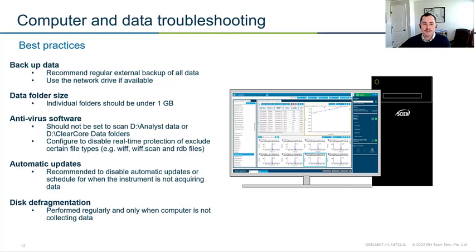The next thing you can do in terms of preventative maintenance is keep those file sizes down. Speaking from a SCIEX perspective, when we save data, we save them in a data file that's called a WIFF file. And within that WIFF file are all the samples, so you can think of it almost like a batch. Within a single file, there might be 30, 100, 10 samples.